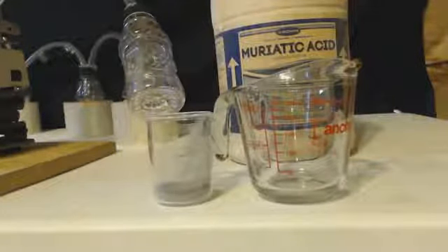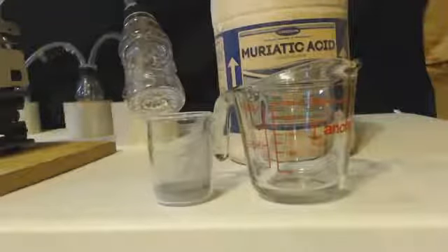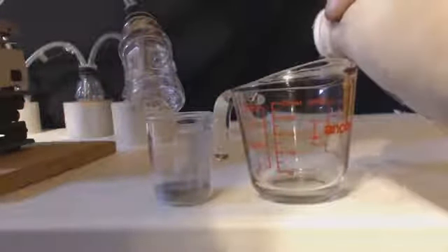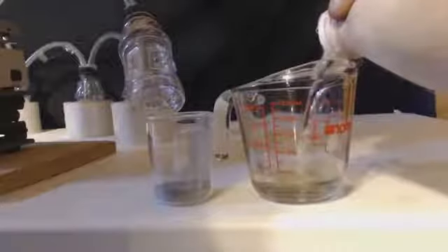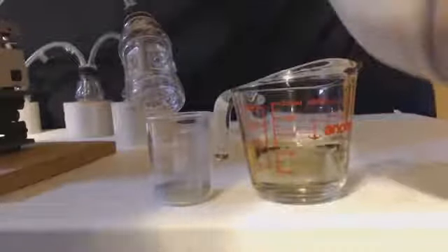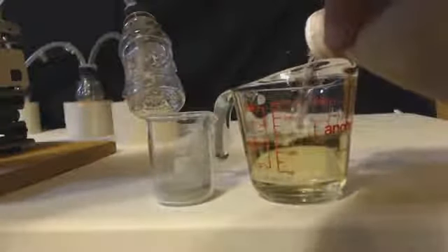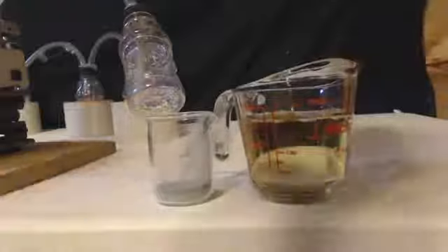On the left, I've got 1 mole of chromium metal powder, which is 52 grams. On the right, I just have regular muriatic acid, hydrochloric acid I bought at a hardware store. I'm going to put 200 milliliters in there. That's 2 moles. I really need 3 moles to do the experiment, but we're going to start off with two. Put it into the equalizing funnel.